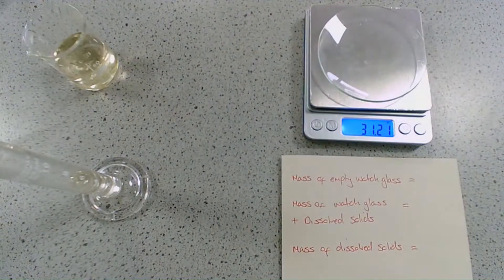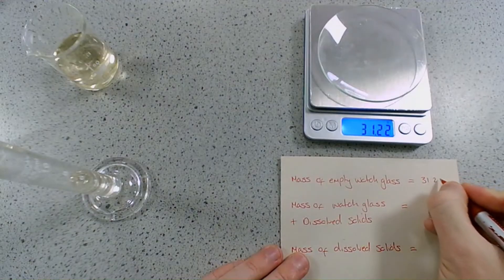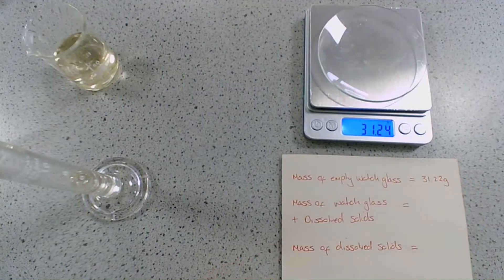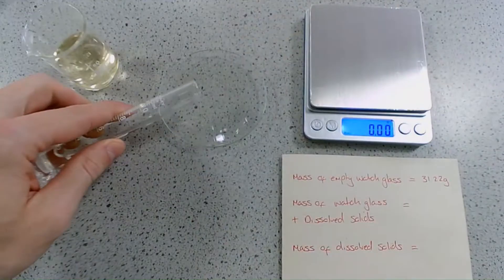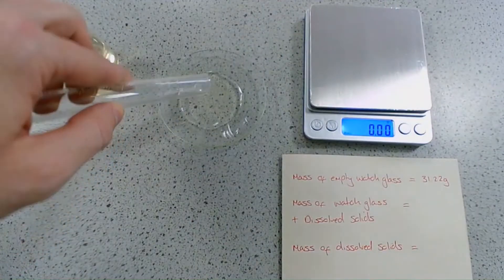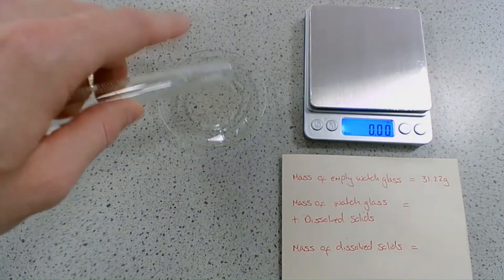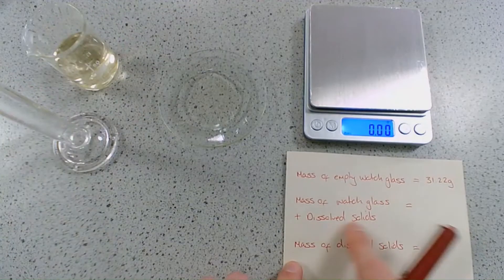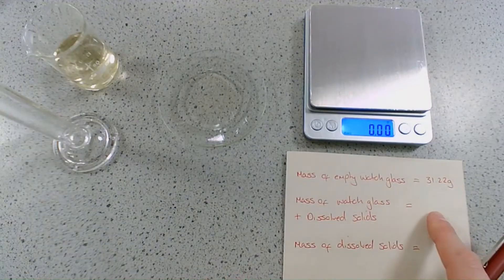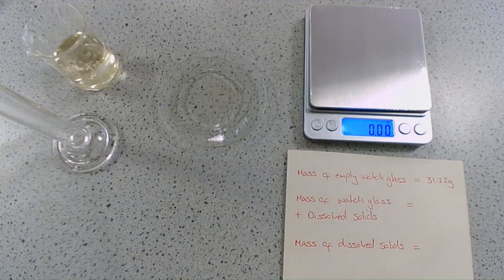Our watch glass on its own is 31.22 grams, and that's important because we're going to add our water sample to that watch glass and then evaporate all of the water, which will only leave behind the dissolved solids. Then at the end we're going to re-weigh the watch glass with those dissolved solids to get the mass, and the difference in mass will tell us the mass of dissolved solids.